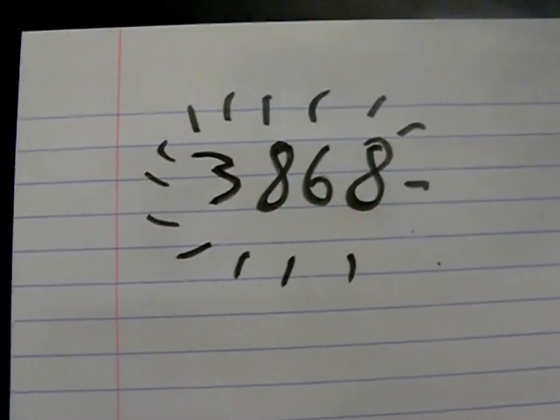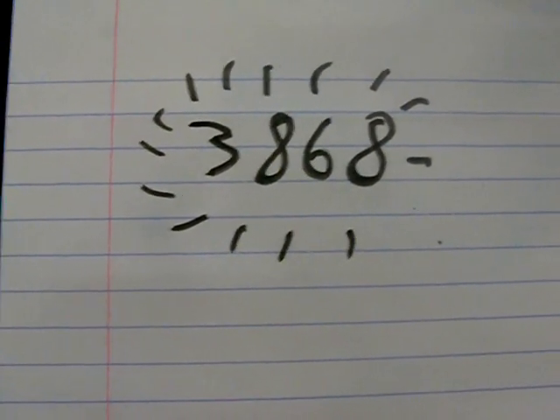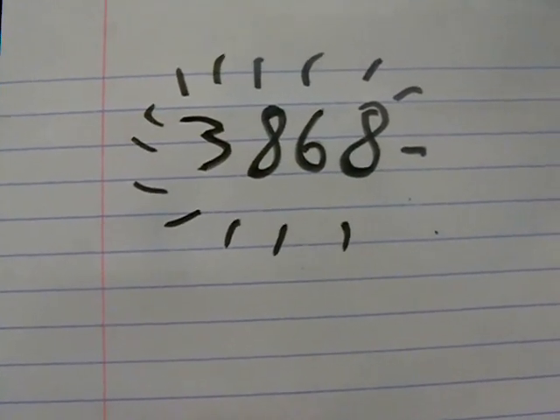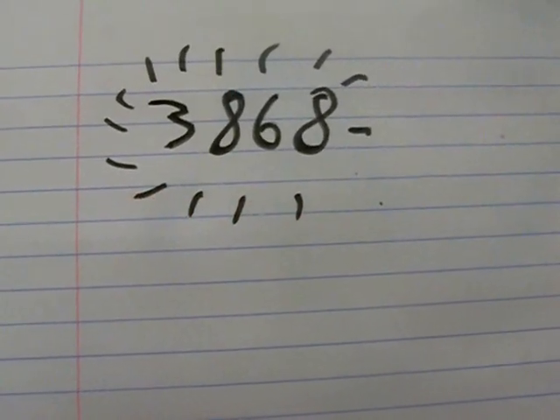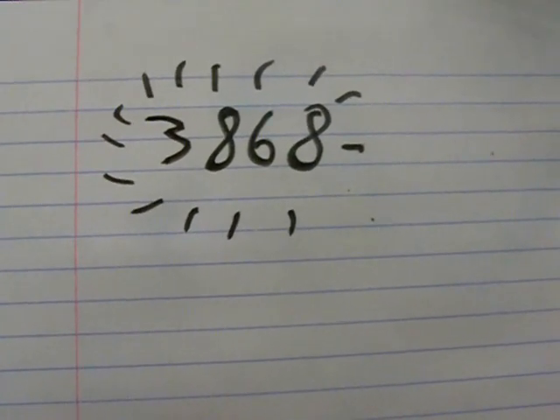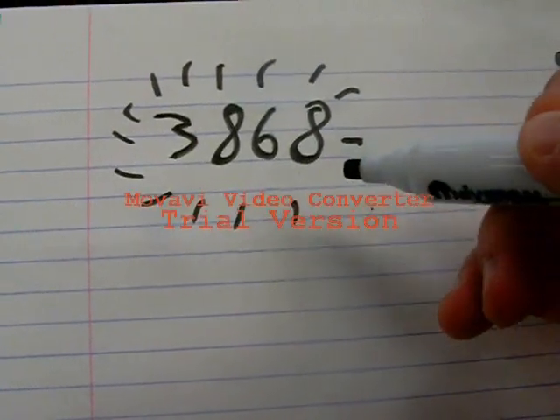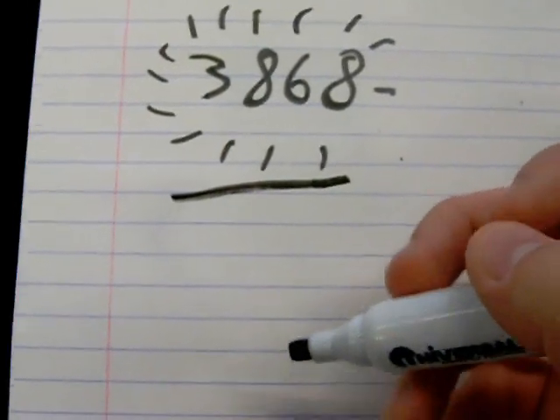So now we have this magic number determined only by the water, the mass of the water, specific heat of the water. What did we need to actually weigh the candle for? Get the mass of the candle? Well, that's because we actually don't know how much heat is given off per gram, how much energy is given off per gram of candle burned. So we have this number right now, which is our Q. And we divide this number by the loss of mass in the candle.